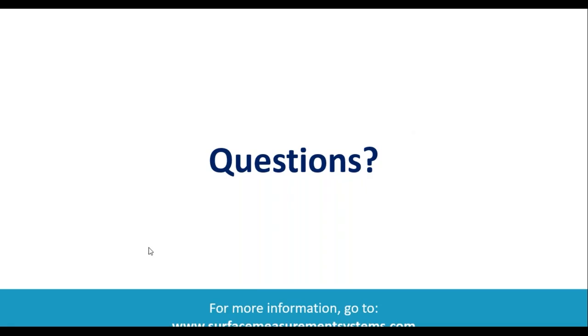Right. And a final question from Wissam. He's asked, is DVS analysis more important or valuable than DSC analysis? Oh, I think this is a very good question. And the answer is both analyses are very important, but the DVS analysis is driven by the applications and use of the material. So if you work in a field which requires understanding the absorption behavior of the material, or you try to use the material in distillation columns, or you're designing new chemical plants and you want to know how much heat is released, I would agree a DVS analysis will be more important. So as I said, this all depends on the application.